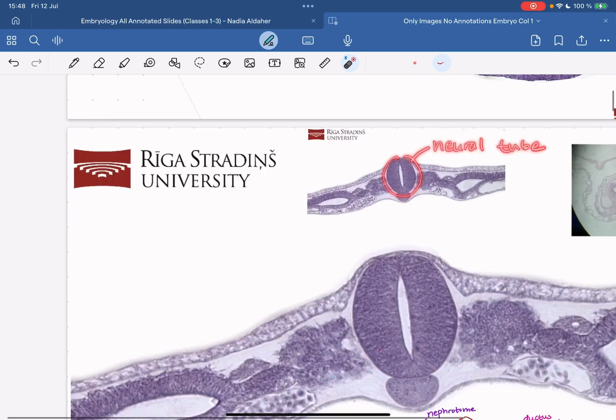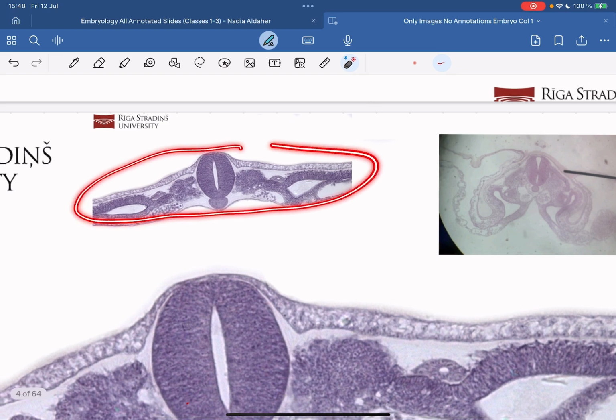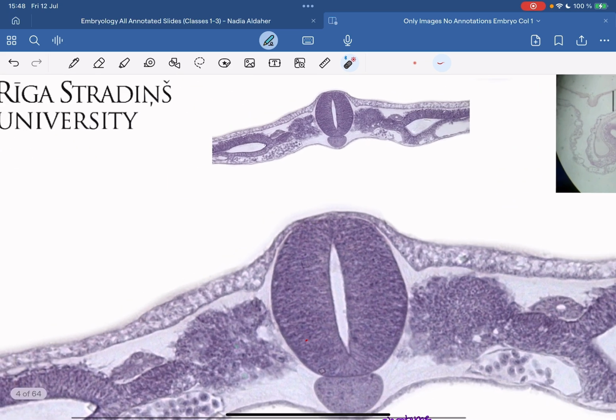It looks like a pair of lips. It's also in embryonic folding. So again, this is folding because it looks like a clover, right? It's folded in, while this is the germ layer, which are two different slides. Don't mix them up, but it exists also in the embryonic folding. We'll get to that in a second.